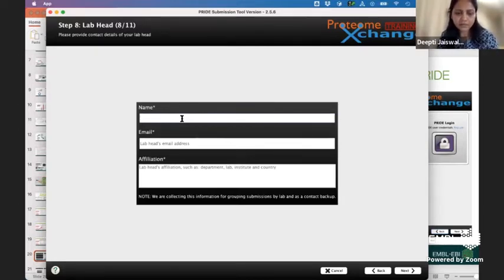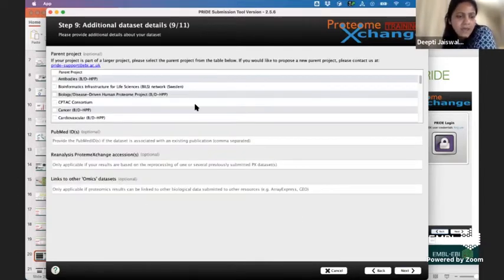For example, here I'm going to provide the student supervisor, then email, and then affiliation. Yes, so you can go to the next step.